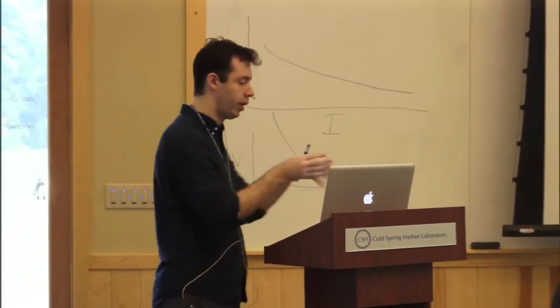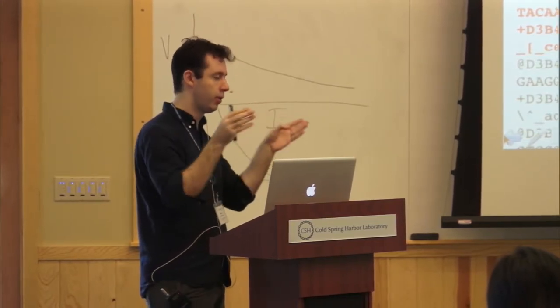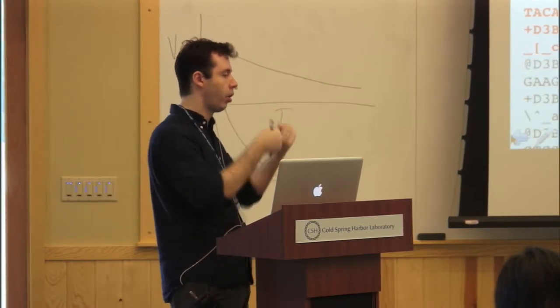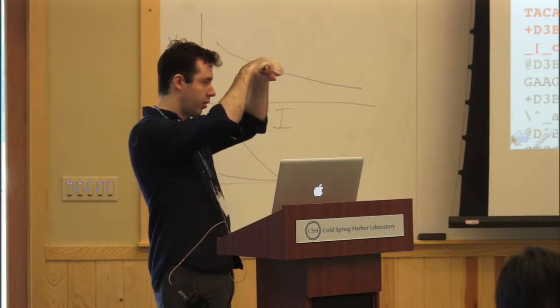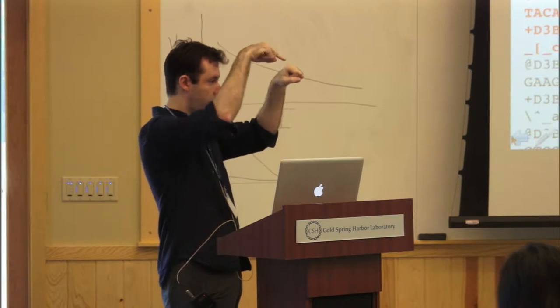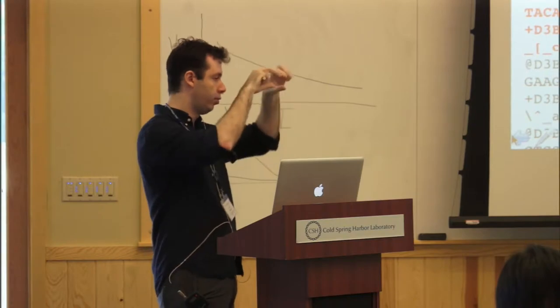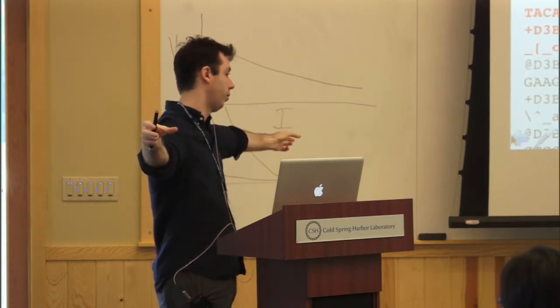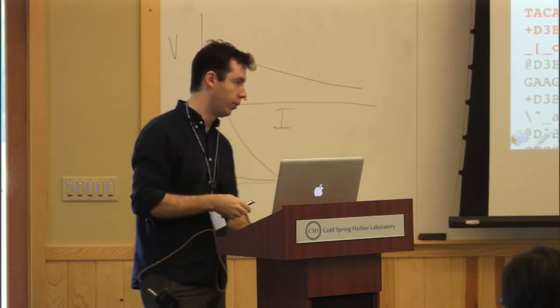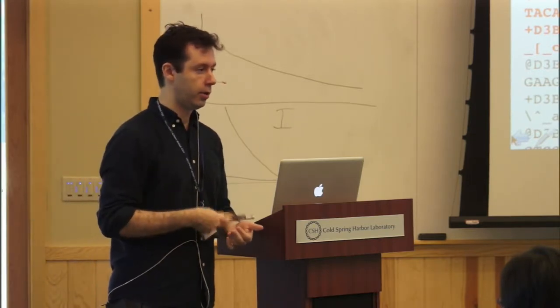That's useful. You can do all sorts of library preparation to essentially sequence longer fragments. What you can do is circularize the DNA fragments and create a junction, right? And you can achieve that using very long DNA fragments. What you can do is sequence the junction. This is the mate pair library preparation type. That allows you to create very long paired reads, essentially, if you want. And that's very useful for whole genome sequencing, where you can really bridge multiple kb of sequence. Okay. Any more questions?